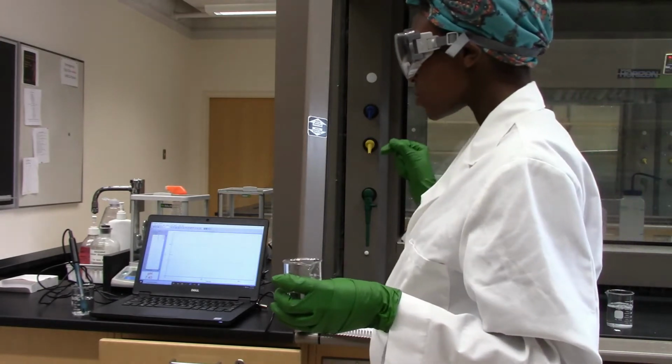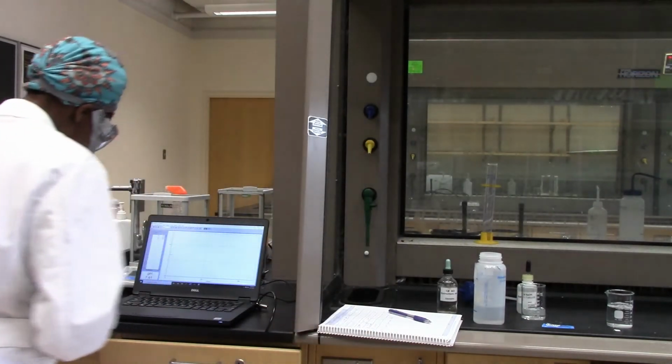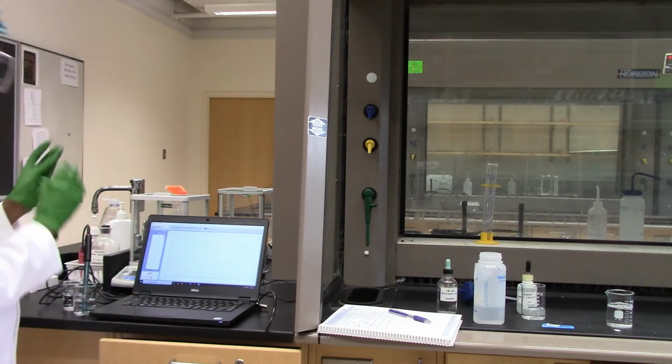So this one is 7.41. So I'll take another one just to make sure that I'm within the 7.4 pH reading for water.